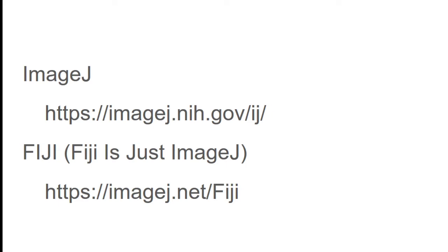In any case, either of these links that you see up here will take you to a download page, and it's fairly simple. Follow the instructions. Make sure you check the instructions. There are versions that you don't have to install, so if you're using a computer that's not yours, that maybe belongs to an institution, you can just download the files and run it too. But you'll need to make sure that you've got the right version. Anyway, it's fairly easy to set up. It's available for Windows, Mac, and Linux. So there are lots of ways to get at that.